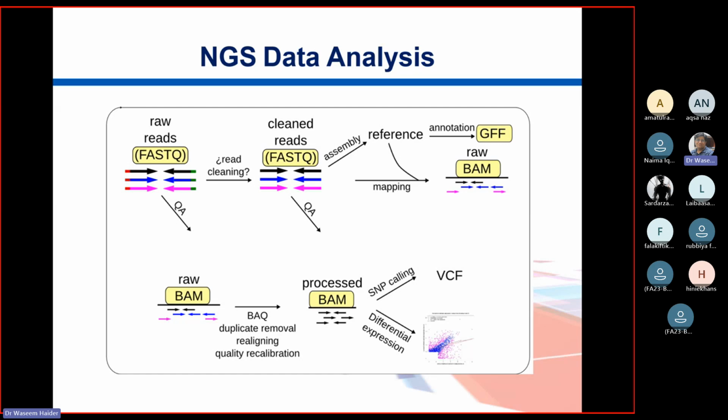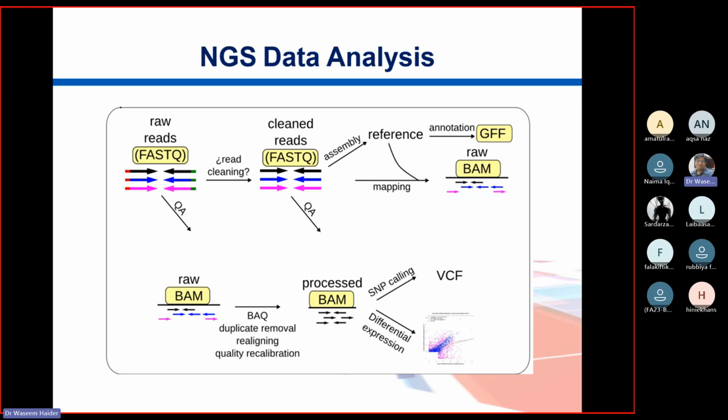So when we align our sequences, we can also get the genome browsers, and we can see how many reads are aligning or mapping, and what are the similarities and what are the differences. Remember last week we had one tool, Tablet. That was a viewer. A browser is something which is even bigger than that.